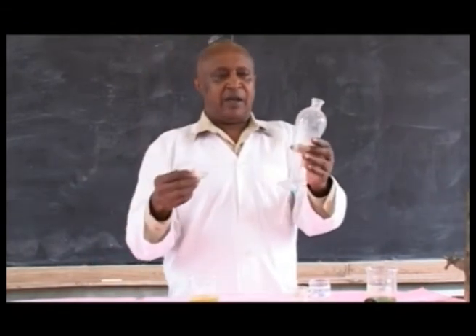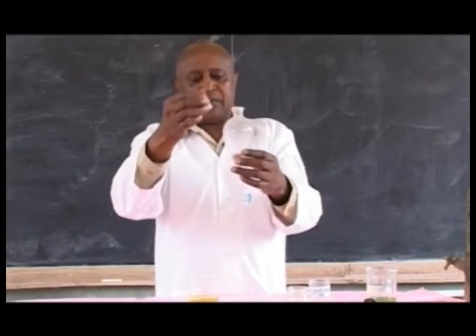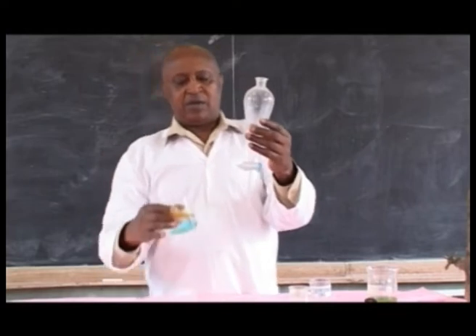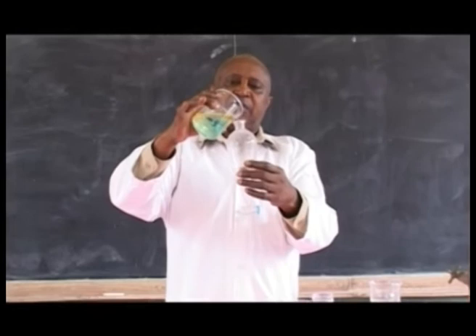We have here our separating funnel with its stopper. You make sure that the tap is closed and you introduce the mixture into the separating funnel.